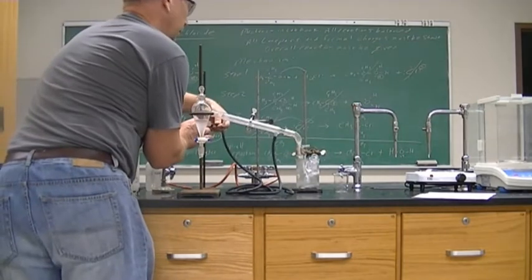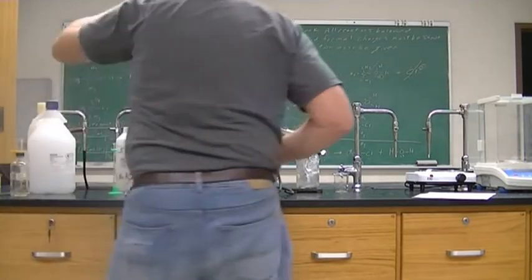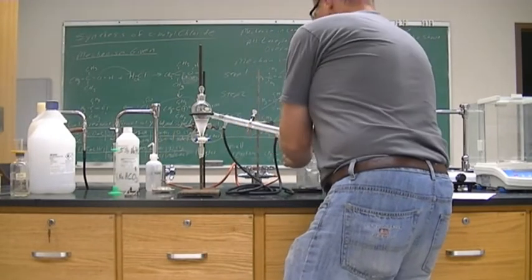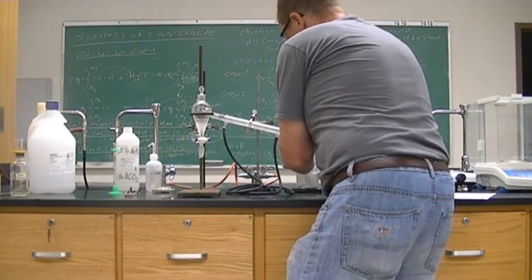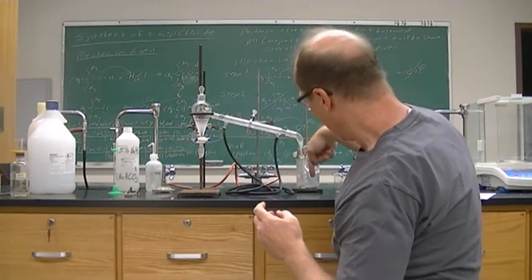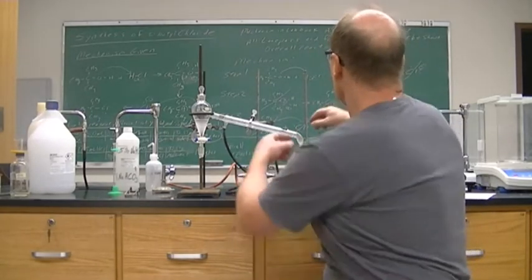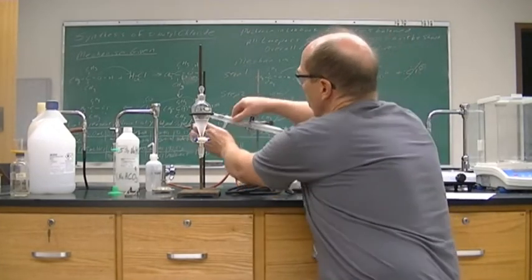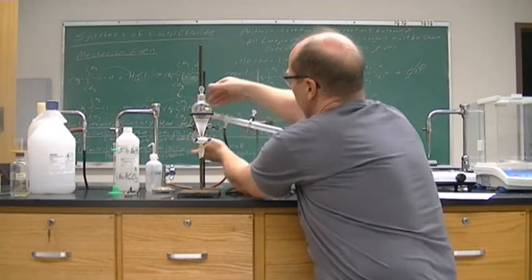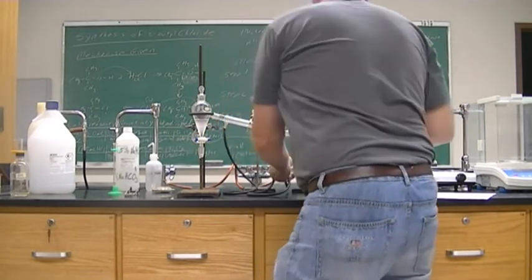Do not force it. It is glass. It will break if you force it. I'm just bringing it down slowly. All right, so now I have this that's dripping in there. It's going to go into that flask, and that's all I'm looking for. All right, so then I have to make sure that all of my joints are nice and tight. All right, and then now I'm ready to hook it up to the water.